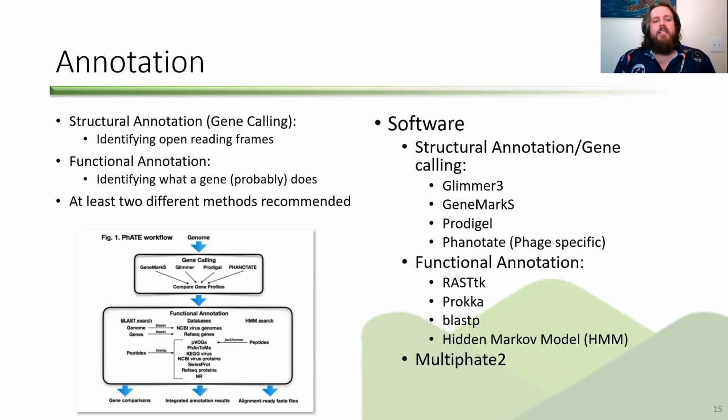What it does basically is use a lot of the software that I pointed out here, and then compares them and runs it through and gives you an output of gene comparisons. So I would recommend checking that out if you're just getting into this and looking for something that may make your life a little easier.